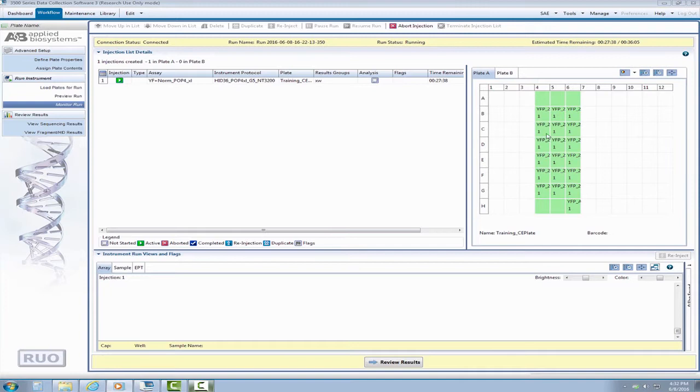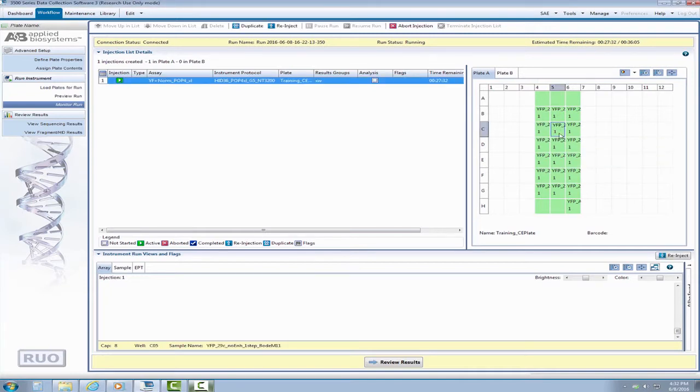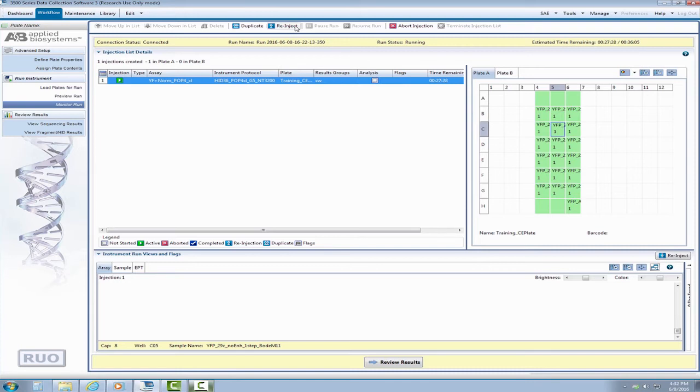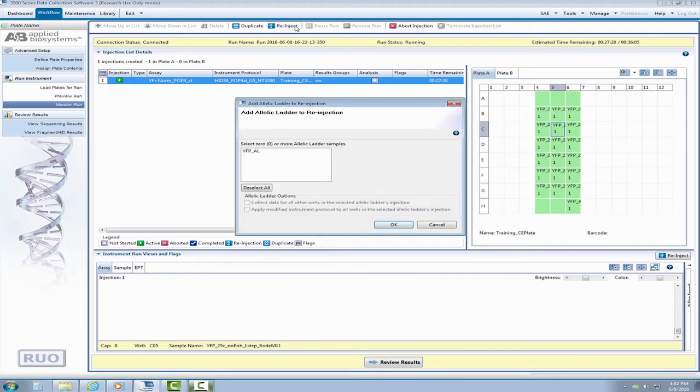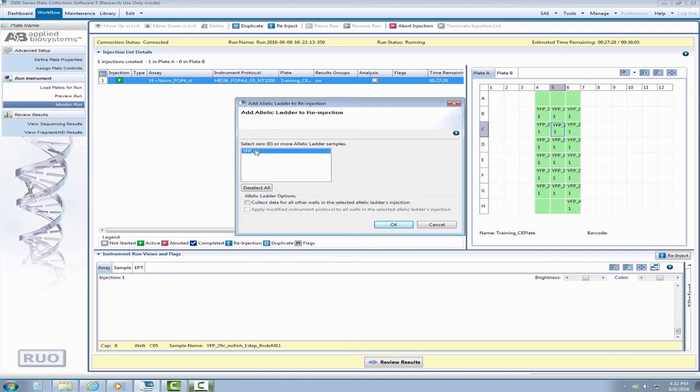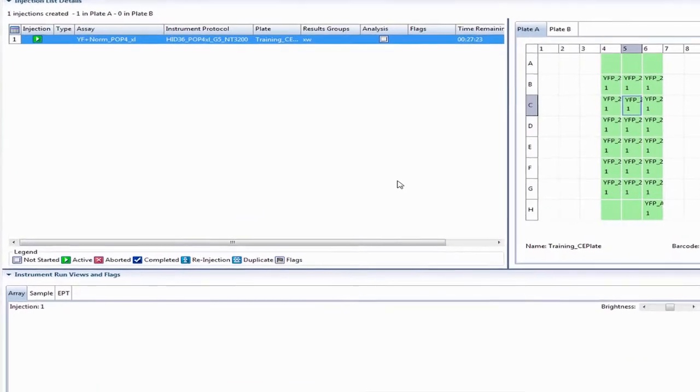So let's go ahead and start a run. There are several ways to reinject your samples. Let's start by viewing the monitor run screen. Now that your run has started, you will be able to select any sample that you wish to reinject by selecting the well from the plate view. Once you highlight the sample, navigate to the top toolbar and select the reinject button. You will be asked if you would like to reinject an allelic ladder with your sample, eliminating this extra step on the front end.